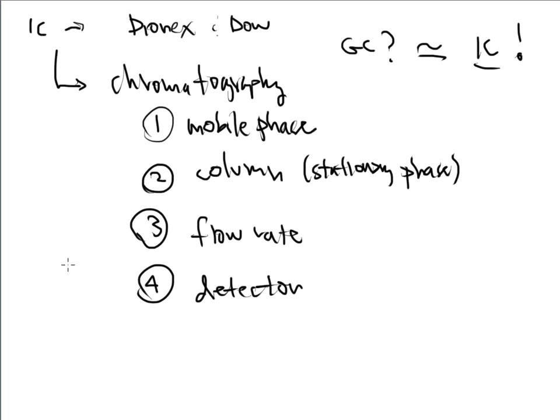As far as gas chromatography goes, we said it's perfect for volatile organic compounds, VOCs, or things with lower boiling points, and especially things that are thermally stable. All right, well, what if they aren't? What if they do not meet that guideline? Well, that's one of the reasons that we have ion chromatography in our lab.